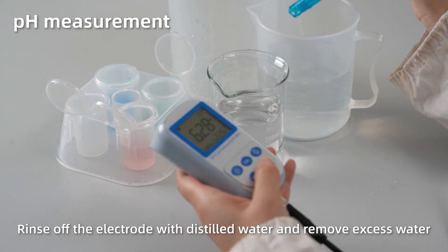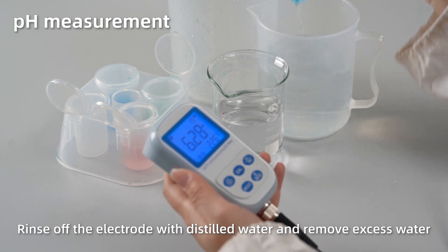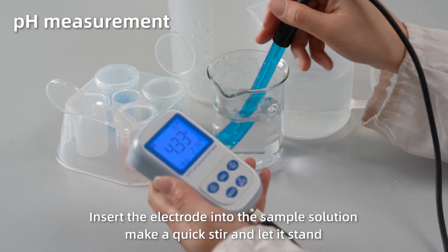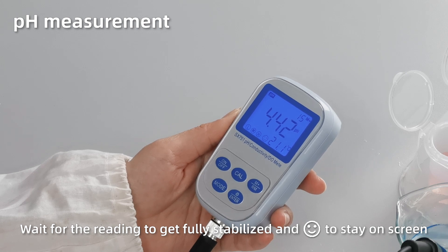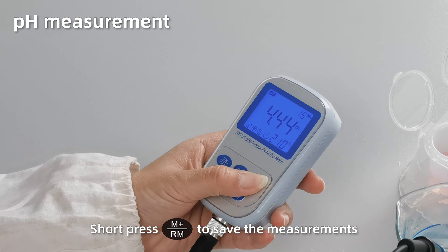Rinse off the electrode with distilled water and remove excess water. Insert the electrode into the sample solution. Make a quick stir and let it stand. When the reading gets fully stabilized and the smiley face stays on screen, short press M+ to save the measurement.